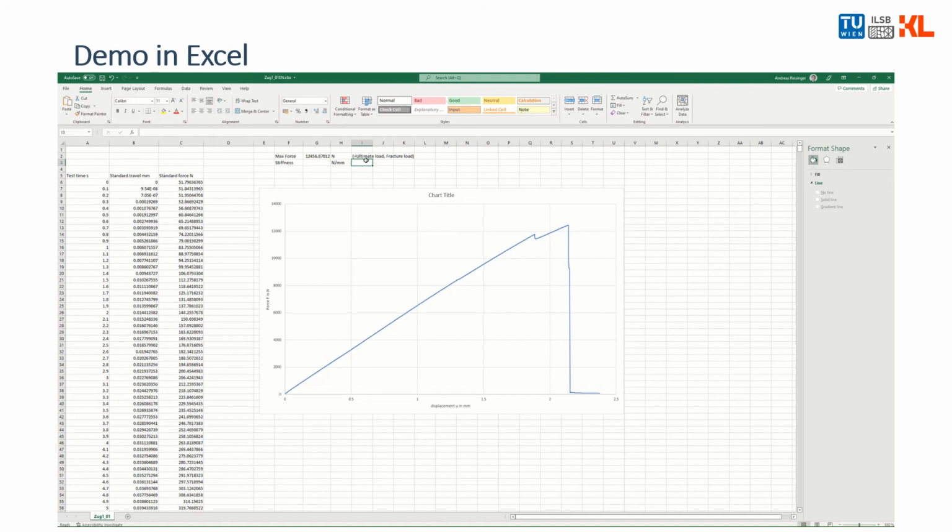Okay, the next question is the stiffness of the sample. So we somehow need to determine the slope of this region here. It's quite linear. There's some small bump here. It could be the case, just from looking at it, that it is somehow bent that way, that means that the slope is decreasing over time.